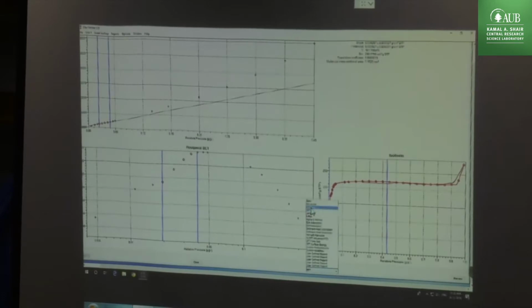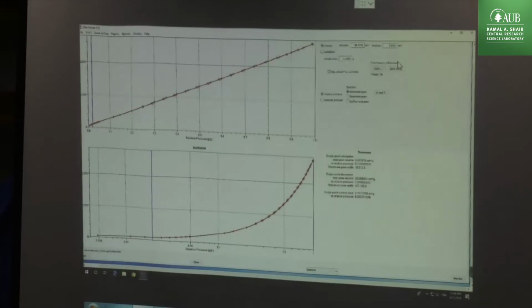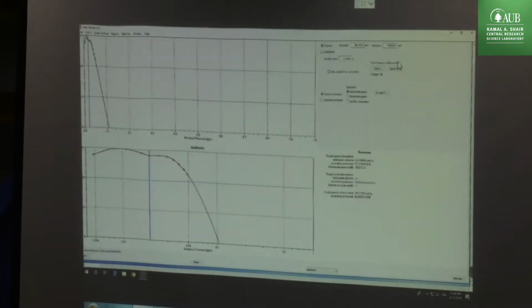If I go to the adsorption isotherm, the first thing you have to see on the plot or the report is the adsorption isotherm. As I said, from it you can get everything you want. If I go to the measured adsorption isotherm, for example, the measured value was 69 or 74. Sorry, 74. You got something like that. This is what I got this morning when I came here, and this does not surprise me, because I said 85% of the people get something like that.